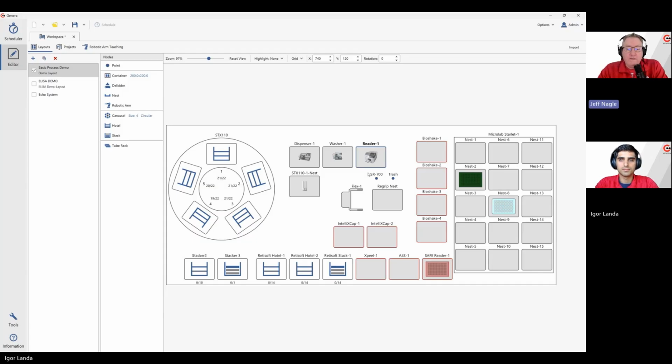All right. Well, that's great, Igor. I appreciate you going through those steps. And now, for everyone who's watched the video, you know how to import a workspace database, which will bring in labware projects, labware operations, zones if you need it. And it makes your life a lot easier when it comes to updating your software.